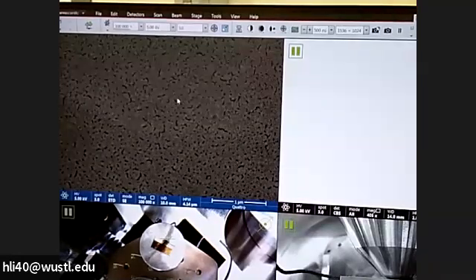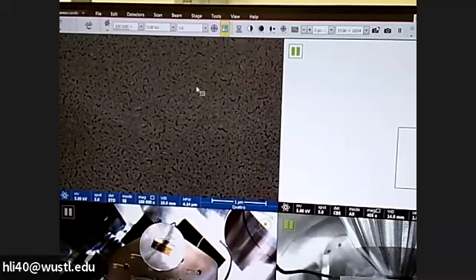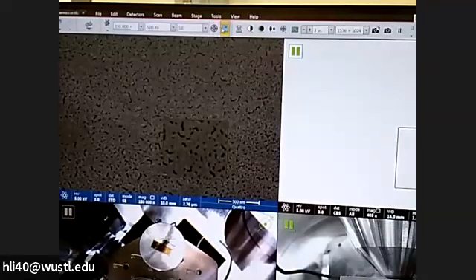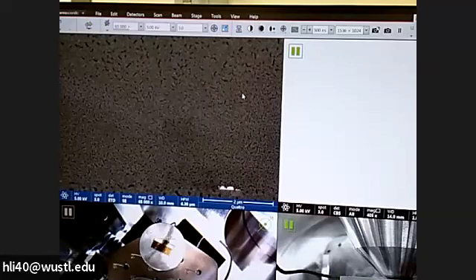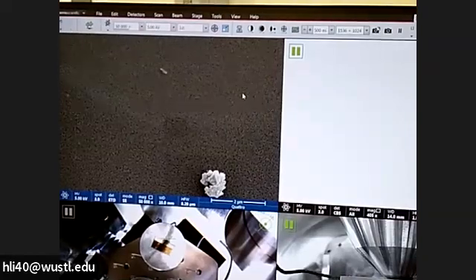Normally, I suggest users focus and do the alignment at high magnification. For example, if you're going to take 50,000, I would like you to go to 100,000 magnification at least to do the focus to make it best. If not, you will not get the best image. After you adjusted the focus at high magnification, it should be in focus at low magnification. You can see it, right? So now we drop down to 100 or 50. It should be very clear. You will not be able to see much difference on the small screen.